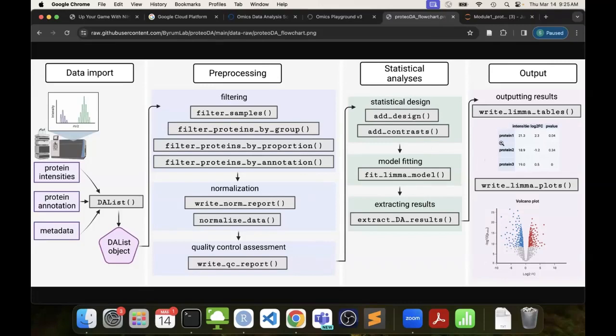And for the results, we have two functions. One just writes all those Excel tables and files, the flat files for the future, if you want to make heat maps or anything else, we have all the data tables. And then the plots function provides some static plots, but also that interactive HTML file. That's generally what we send with every project if you use our core. So that all comes as part of our service.